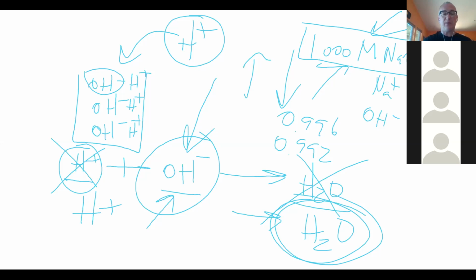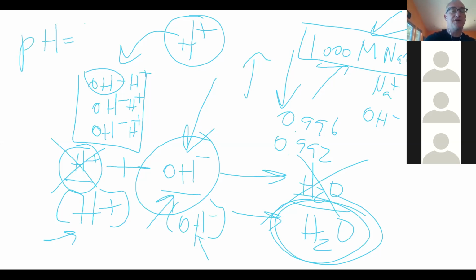It's when I want to measure either the concentration of H plus or the concentration of OH minus. And I do that by having one of these in a very precise concentration and then adding it to the other one until they balance perfectly. And when they balance perfectly, then my pH basically goes to 7 when they're precisely the same. We're not always going to have a pH meter to measure it, but when we get really close to them balancing out, the pH changes rapidly. Because if you remember, pH is a measure of 10 to the minus whatever this number is.